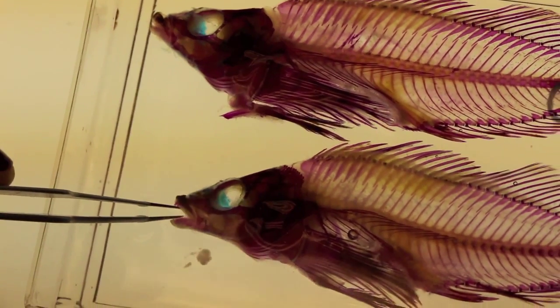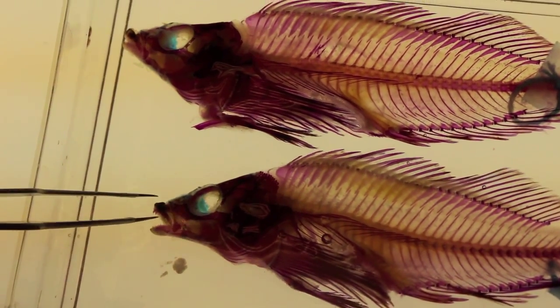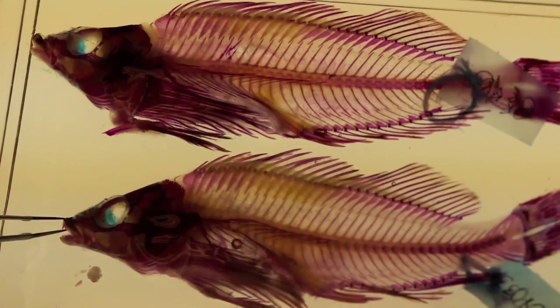Here in Elver Lab, we use cleared specimens to study the size and shape of different skeletal structures, and how its form relates to its function.